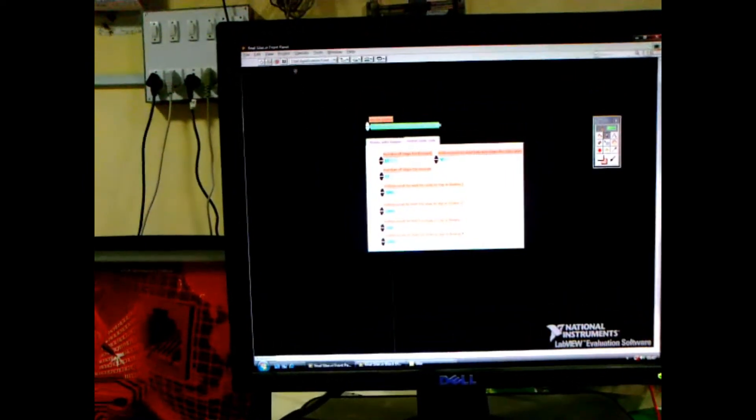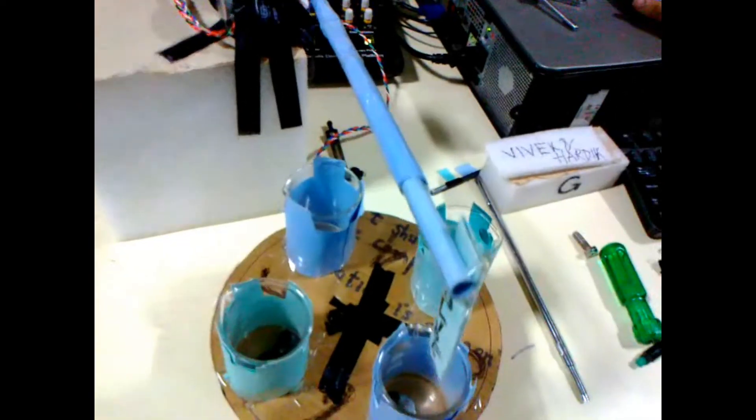Now we are going to start this program. We are going to click on the start button — and this is how it works.